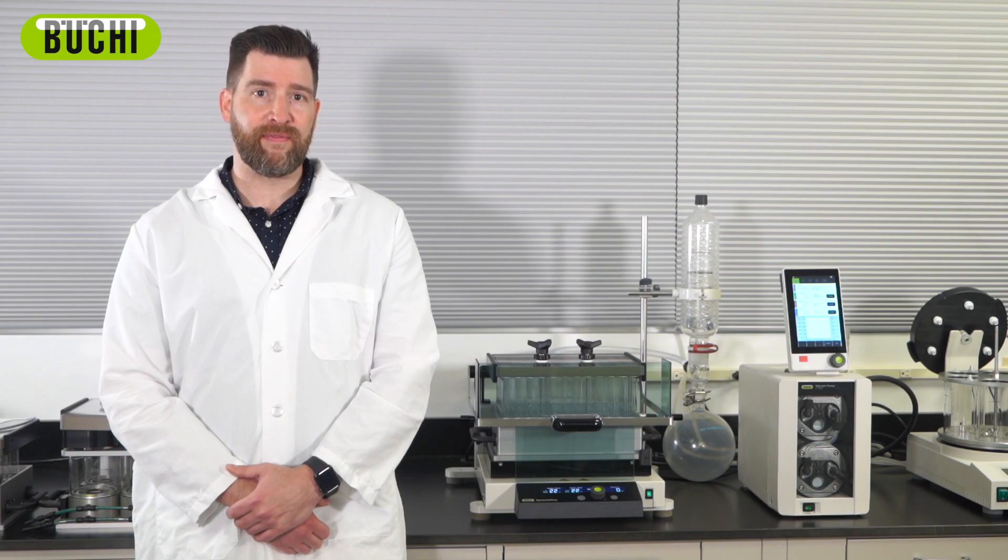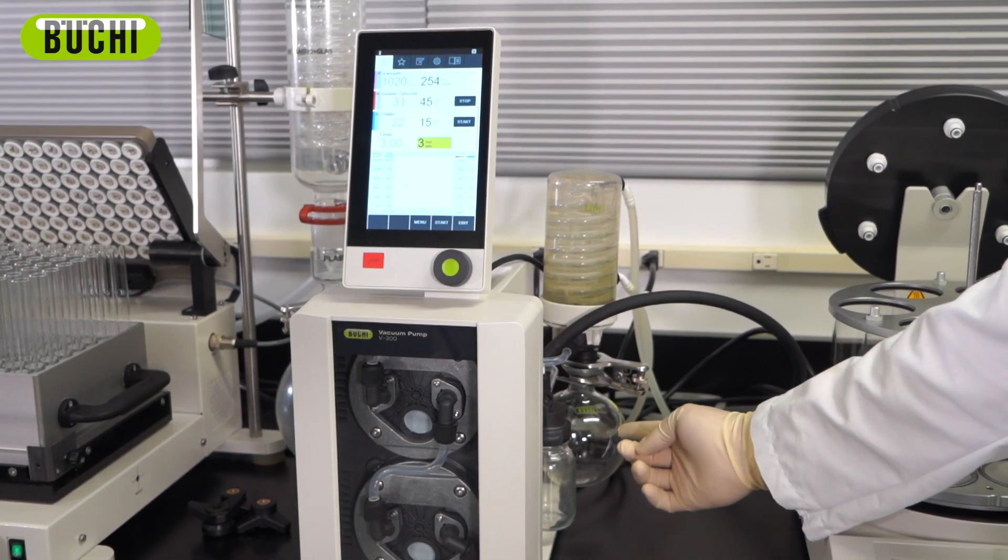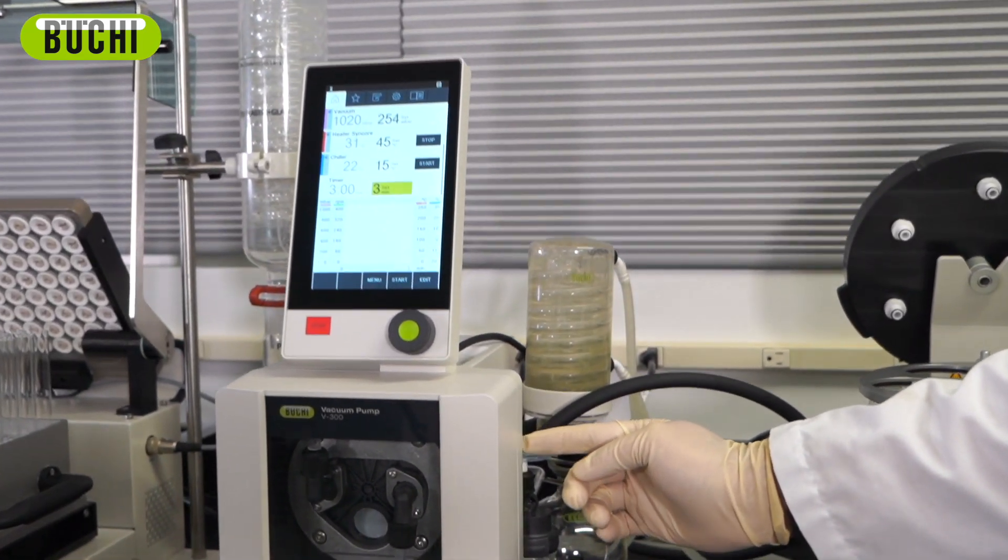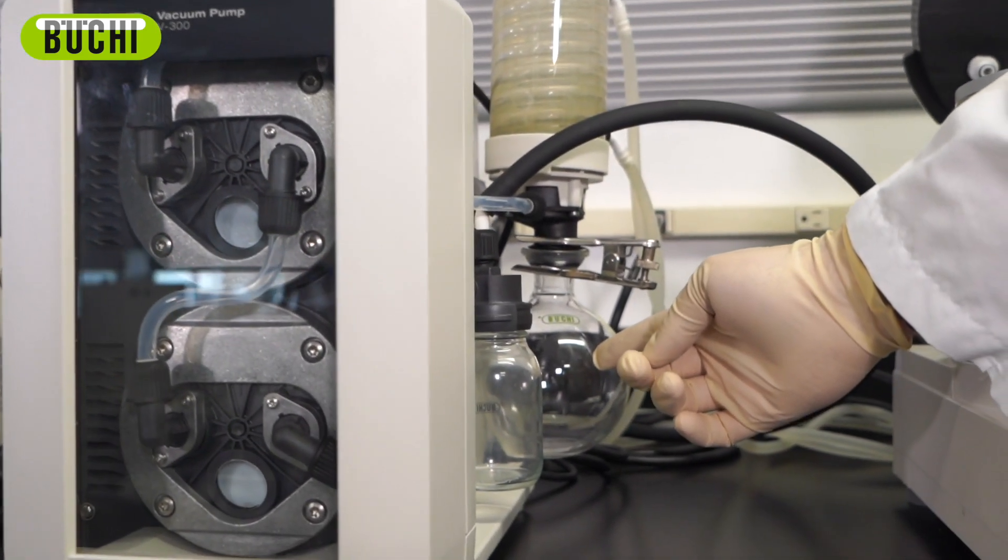If you have concerns regarding safe and environmentally friendly solutions, don't worry. Our sophisticated condenser and accessories ensure those concerns are addressed. With our secondary condenser, you can recover more than 95% of your solvent.